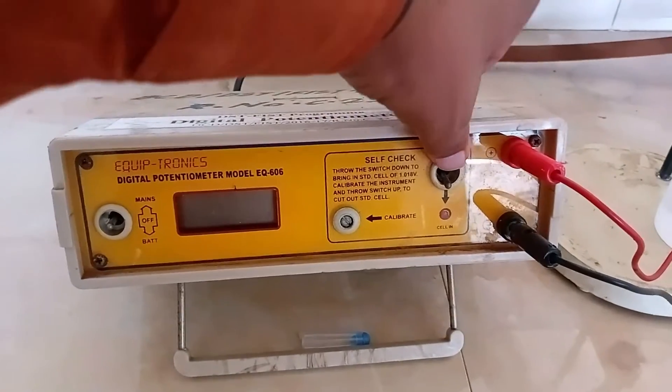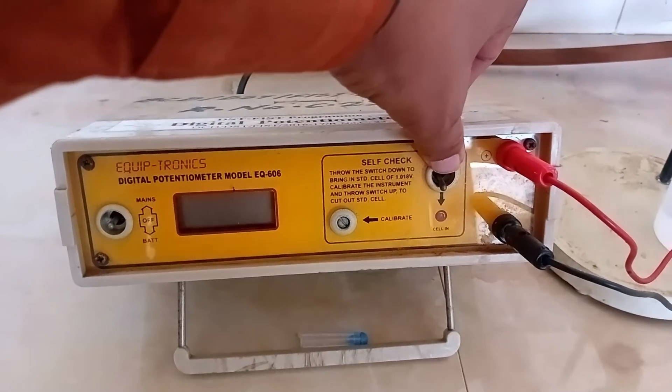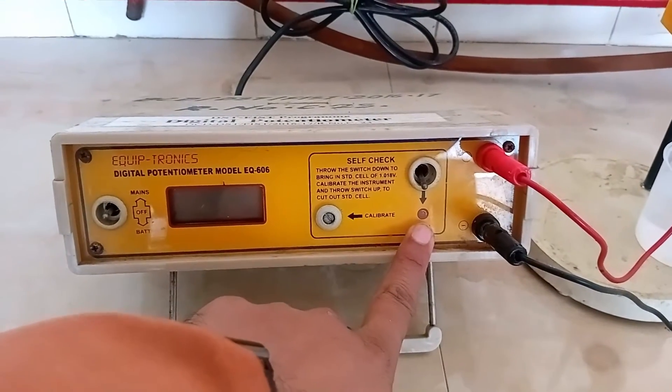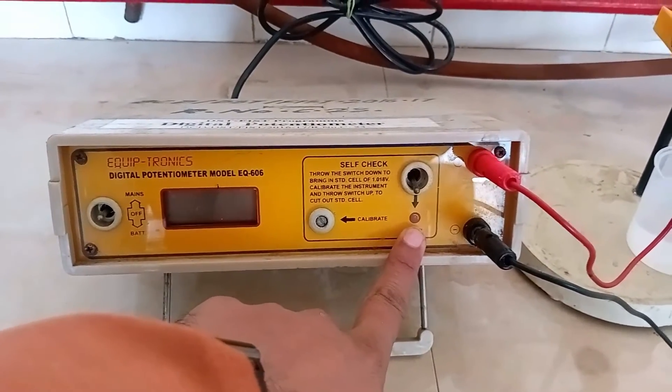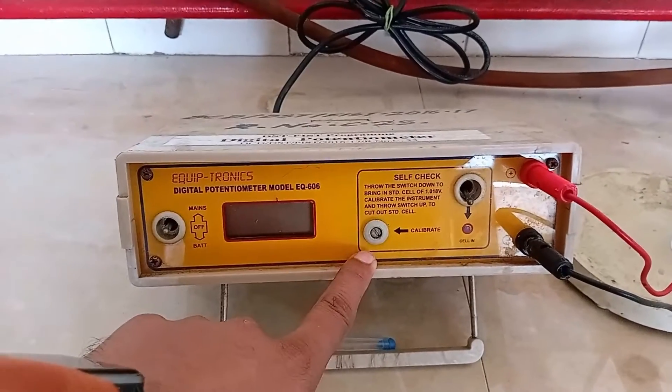This is the standard knob. For measurement of EMF, shift this knob UP. The standard cell turns ON when it is shifted DOWN. This IS indicator shows whether the standard cell is ON or OFF. This knob is used for calibration of the instrument.